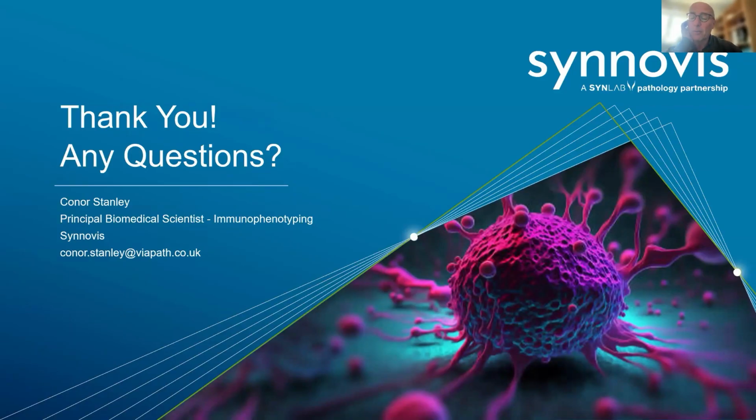Obviously, to go from not having availability of flow cytometry in Zambia, where would you start? Because going straight to the full package of flow cytometry would, I imagine, be very costly and also need a very, very skilled team, and that wouldn't happen overnight. So where would you start if you wanted to start this in Zambia?